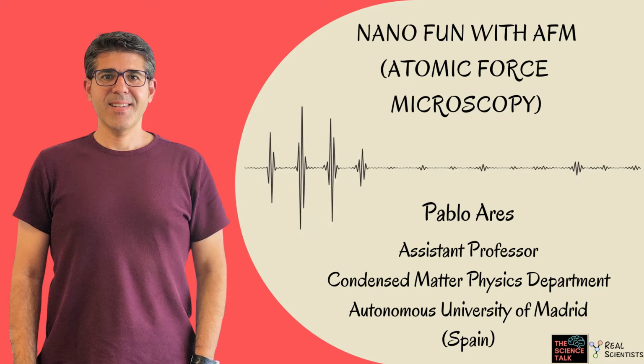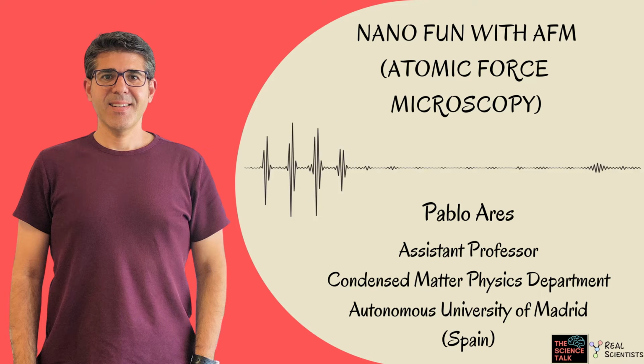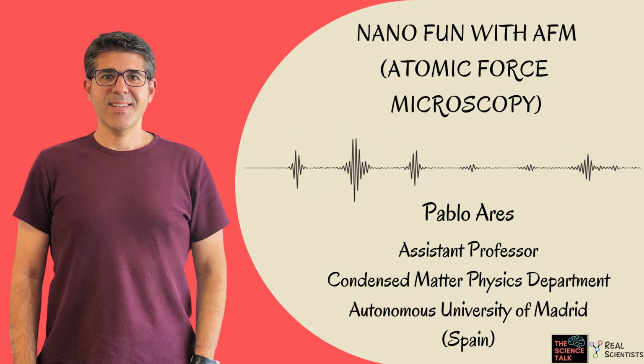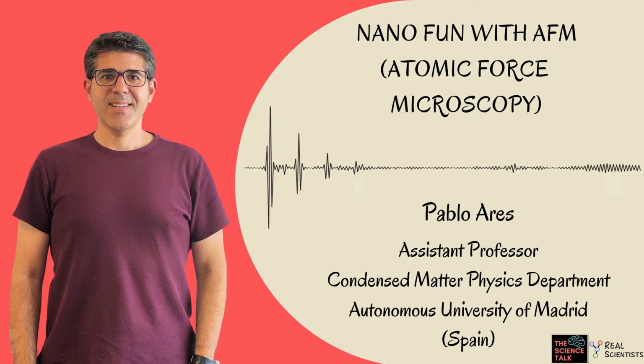So basically I use AFM and other techniques to study, as I told you, low-dimensional materials. And in the last years, I'm mainly focused on 2D materials, graphene and other 2D materials. So we use this nano tool to study these materials. Okay, all right, that sounds cool. AFM is also one of my favorite techniques that I used during my master's and PhD as well. So we can talk a bit more about that, of course.